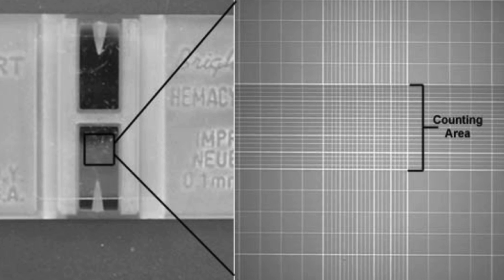So you see a hemocytometer on the left hand side, and what you see on the right is a zoomed up view of this grid right here. So it's this grid that has been zoomed up on the right hand side, and whenever a sample is placed in here, you would be seeing the components of that sample, those blood cells, or those white blood cells. Actually, those particular cells would be visible for you to count. And then there's a criteria for counting.